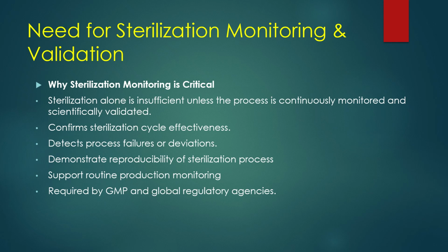It also demonstrates the reproducibility and reliability of the sterilization process under routine operating conditions. Furthermore, monitoring supports routine production activities and ensures compliance with GMP and global regulatory requirements.